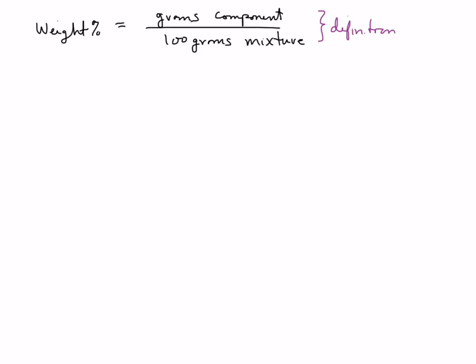The last part is where, like I talked about in lecture, you are going to take a mixture and separate that mixture into its components. Some mixtures are harder to separate than others. This mixture is pretty easy. Here's your mixture. It is a heterogeneous mixture.